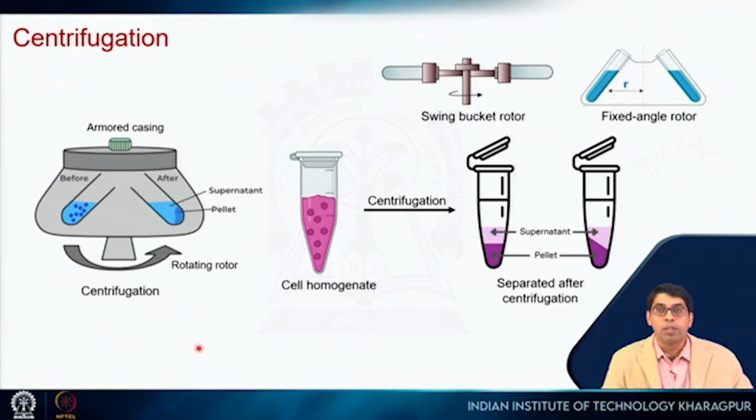Okay. So once it salts out, you actually have to precipitate it, right? You can let it sit and hope that it will precipitate out, but that can take time. However, we can speed up the process by using something called a centrifuge, right? So the process is called centrifugation. Let's say you have your protein of interest in a tube. You just spin it, and then the larger clumps that are formed will all precipitate out like this, right?